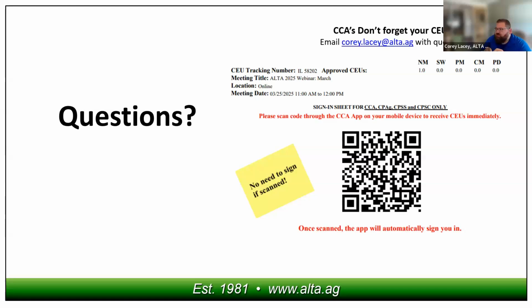So that's actually interesting. I wonder about the data review component of using artificial intelligence in that way too. We do have a couple questions that came in the chat, and this goes to quality control, quality standards, quality assurance. One question was, can you run with an internal standard? So before you start, can you explain what an internal standard is? Maybe make a recommendation, because I know different labs use different internal standards.